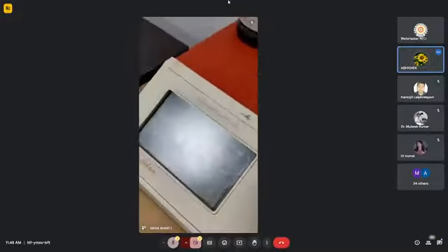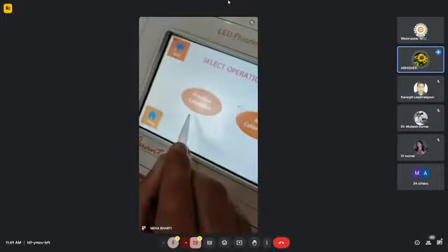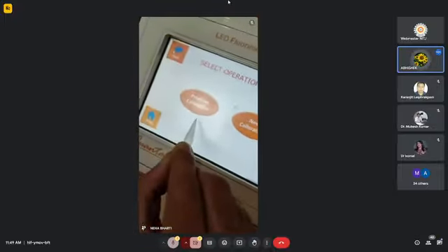So we tap on this calibrated fluorescence mode, and we have two options: whether we want to continue with the previous calibration performed earlier, or do a new calibration in fresh mode. We are going to do the calibration right now.